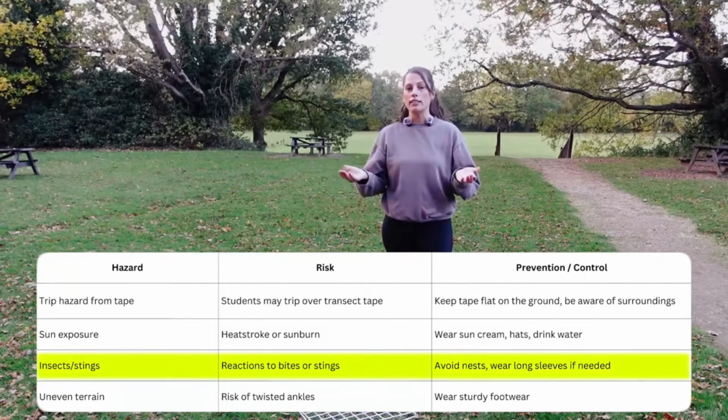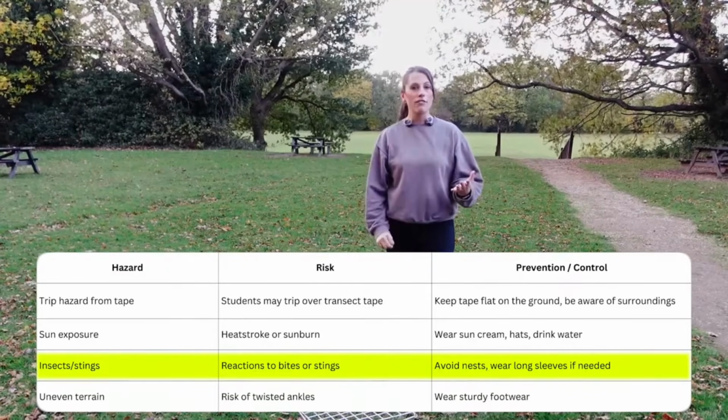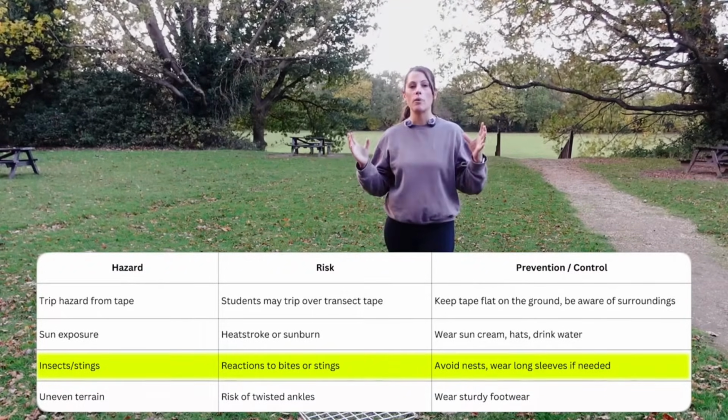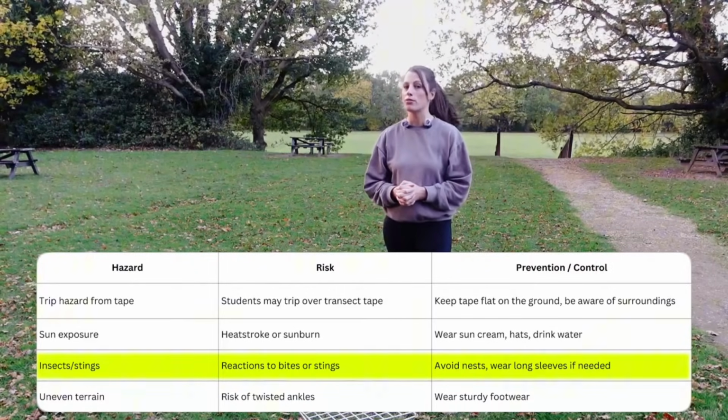And there could be the risk of plants that could sting. There might be nettles. Students might have allergies, hay fever. There could be insects that could sting as well. So those are the other considerations that students should have for their risk assessment for this required practical.